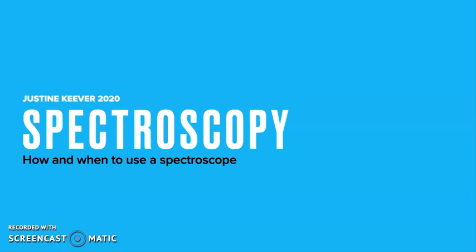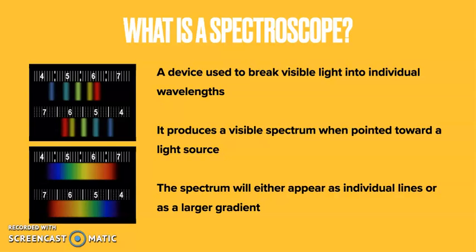Spectroscopy. This is how and when to use a spectroscope. So what is a spectroscope? This is a device used to break visible light into individual wavelengths. It produces a visible spectrum when pointed toward a light source.